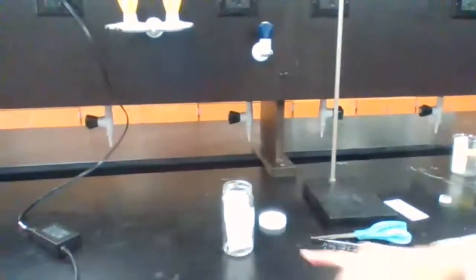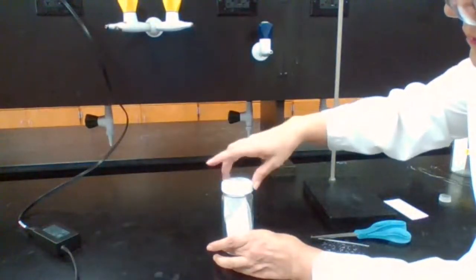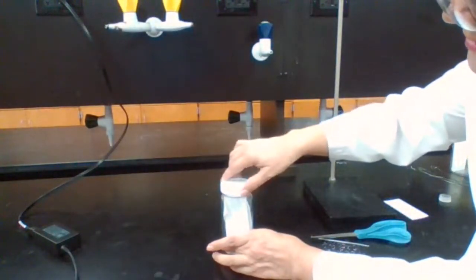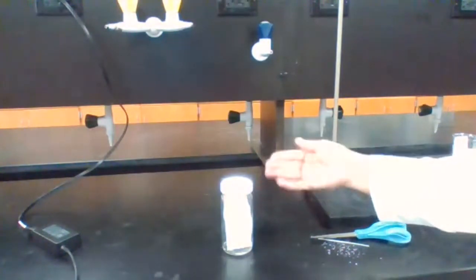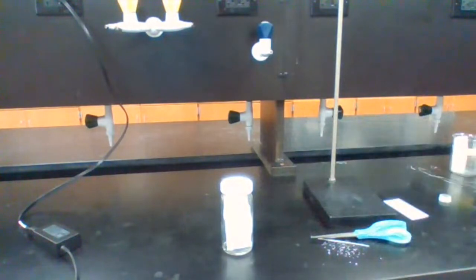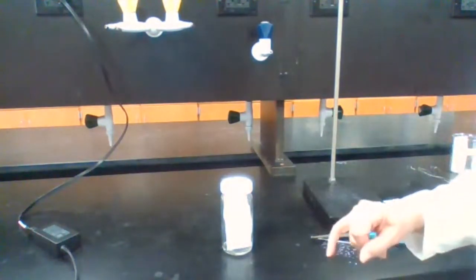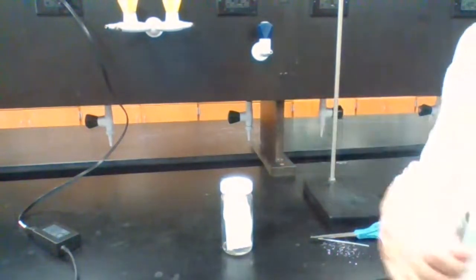Do you see the moving of the solvent? Yes, okay. So the solvent is moving up, and when it reaches about half an inch from the top, I have to stop and mark it with the pencil for the solvent front. I have to be careful not to go over the top.